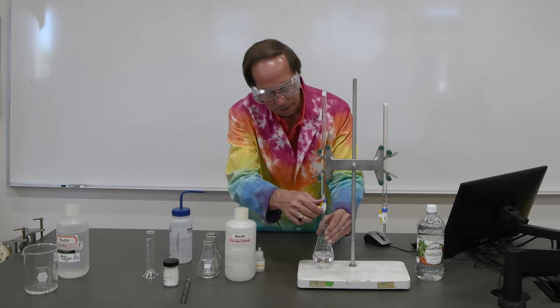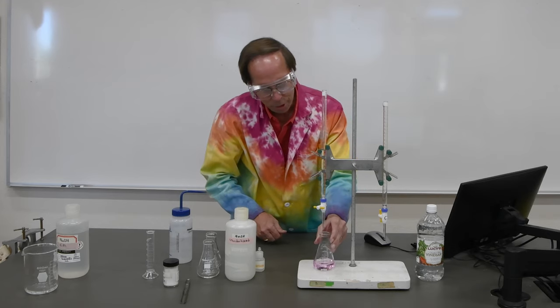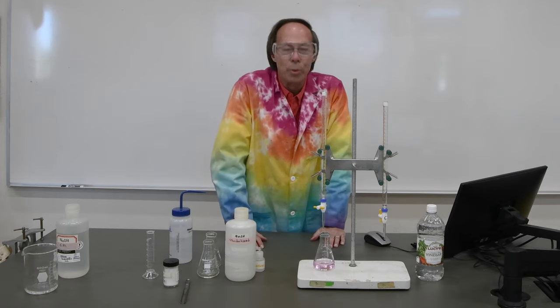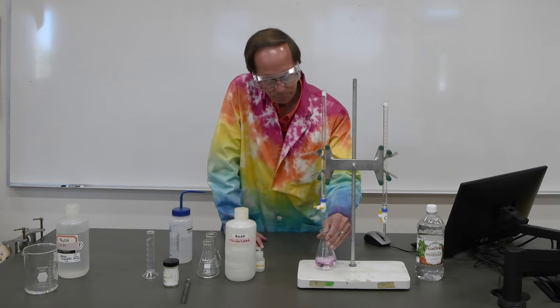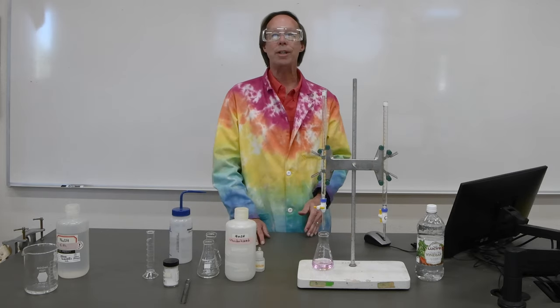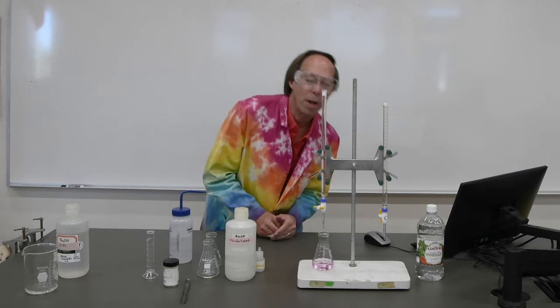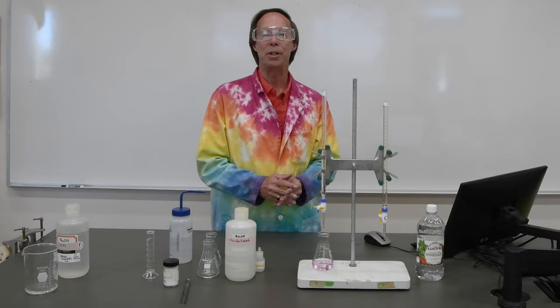Yes, the pink is beginning to stay longer now. There we go. Let's see if that pink color stays with us for a little bit. If it does, then we've truly reached our endpoint. It looks like the pink is persisting, so we have reached the end point, and it did take approximately 13 milliliters. We'll go ahead and take a more accurate reading now.